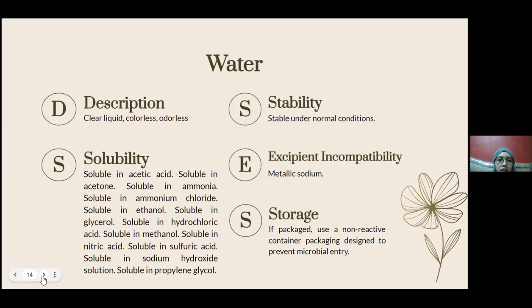For water, it is clear liquid, colorless and odorless, soluble in acetic acid, in acetone, in ammonia, in ammonium chloride, in ethanol, in glycerol, in hydrochloric acid, in methanol, in nitric acid, in sulfuric acid, in sodium hydroxide solution, and in propylene glycol. Water is stable under normal conditions, incompatible with metallic sodium, and if packaged, use a non-reactive container packaging designed to prevent microbial entry.